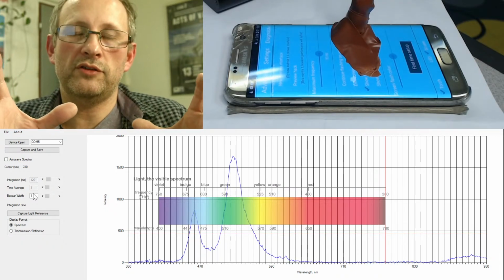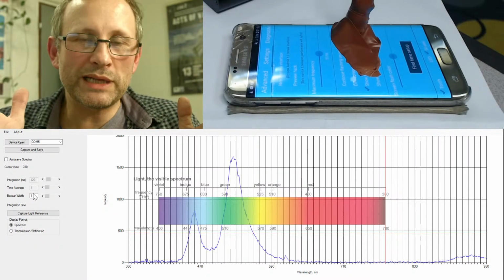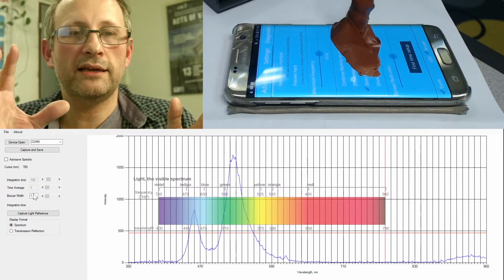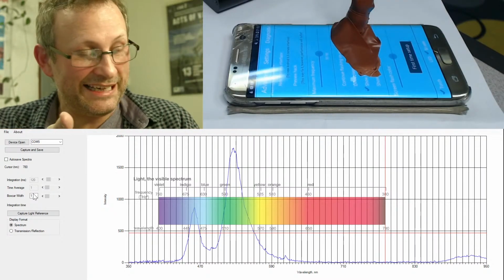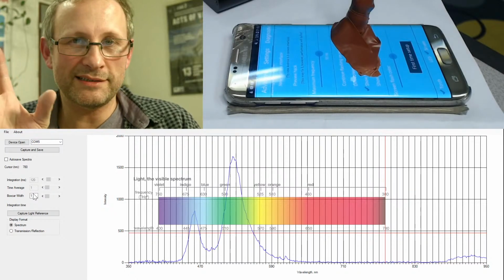And you know, if you're not trying to do things to the 50th decimal place, I think I've already demonstrated with this simple experiment, using the LED, the Samsung, whatever they call them. It's not an OLED on this, but it's their own thing.